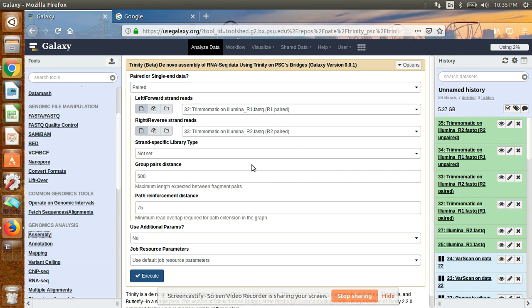Trinity is mainly a Linux-based software; you can use it in a Linux system, but that requires many commands. You can also use Trinity on the Galaxy server online. Last time I discussed trimming your data using Trimmomatic. Now I am going to discuss how you can use Trinity to assemble your reads — this is called de novo assembly, used when a reference genome is not present.